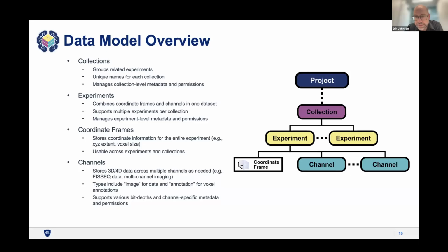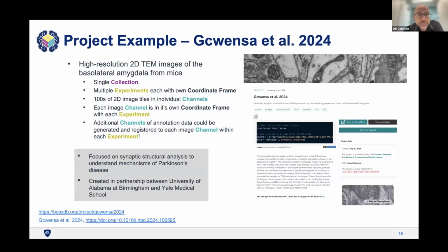So you can visualize at low resolution, very large regions, and then zoom in very dynamically on smaller regions that you need.